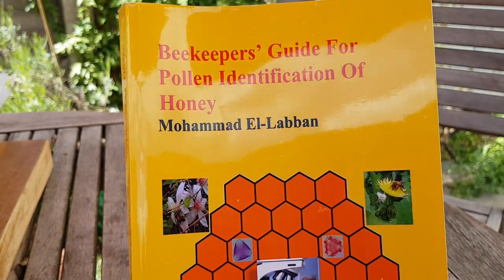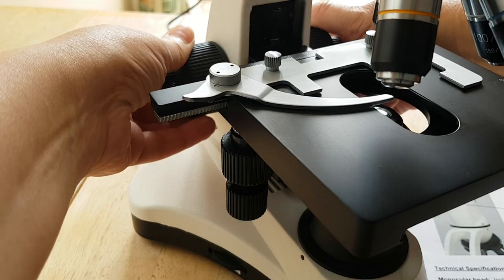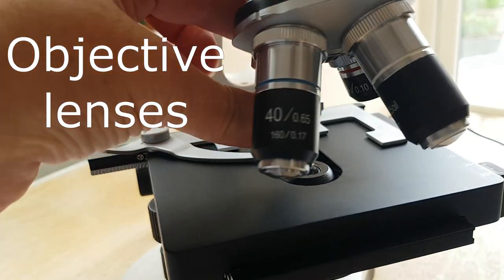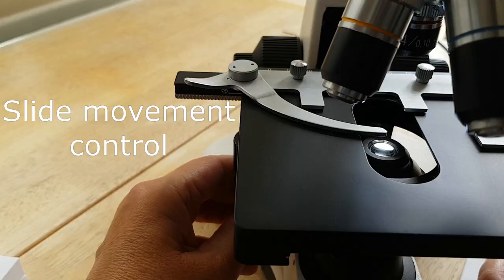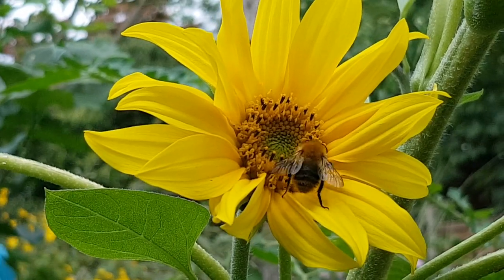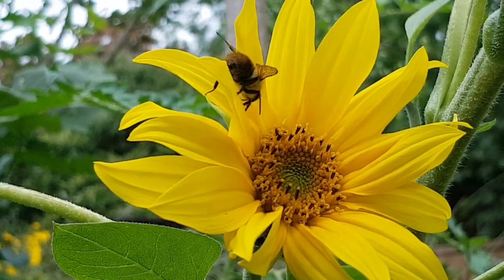Let me show you my microscope - let's see if we can identify my honey. Complete novice - can I do it using Mohammed's book? I've got my microscope set up, I just need to calibrate the lenses for focusing. Let's go and collect some pollen from a sunflower - I'll take this sunflower head, snip it back, and put it into a plastic bag.